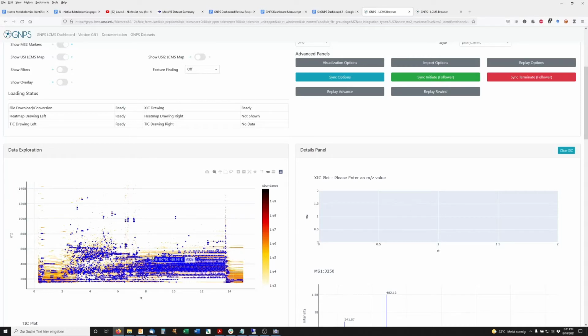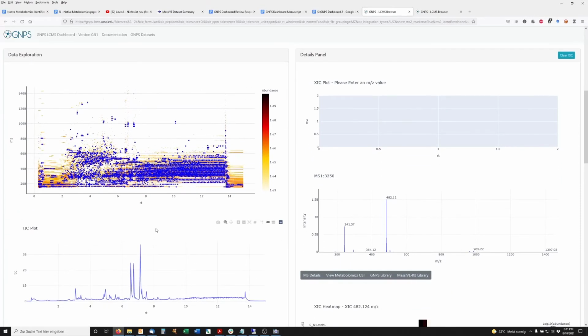So now as a next step, you can scroll farther down and you eventually will see here the TIC plot. So this is the total ion current. Probably familiar, as this is a very classic or typical visualization you would get in other vendor data analysis software. Now, similar as in other standalone software tools, if you click at a different time point in here, on the right, you will get a mass spectrum. You can do this again, clicking here at the highest peak. So here now we have the MS1 mass spectrum from this particular run.